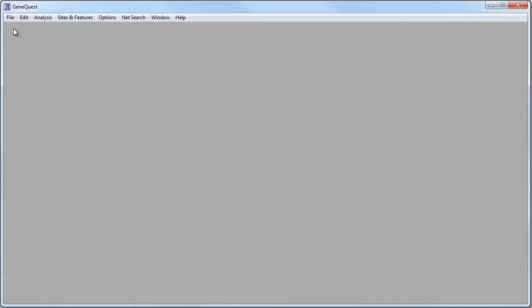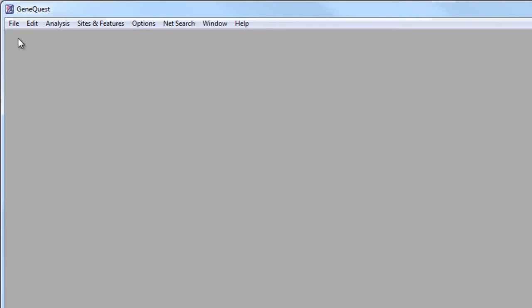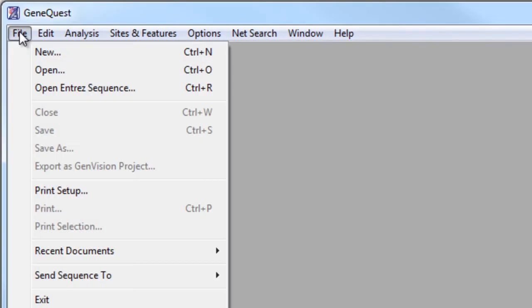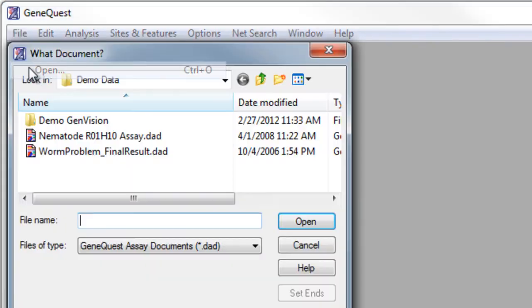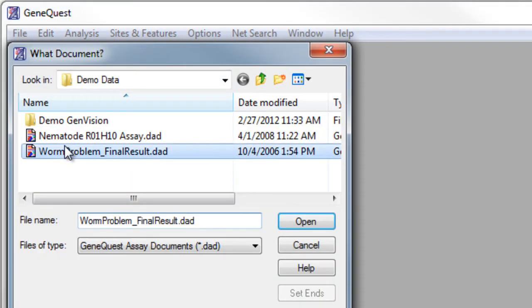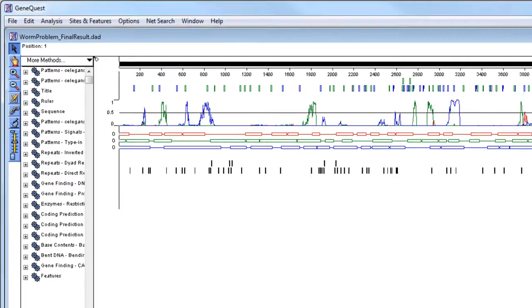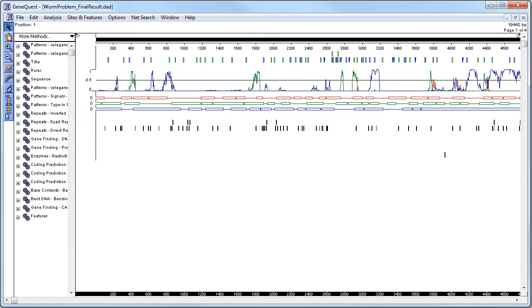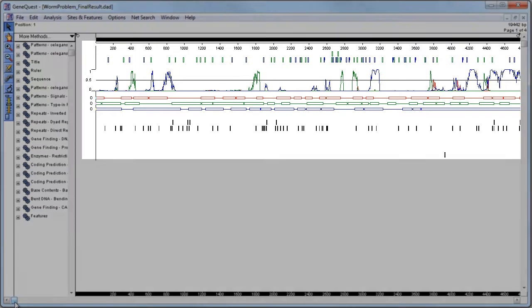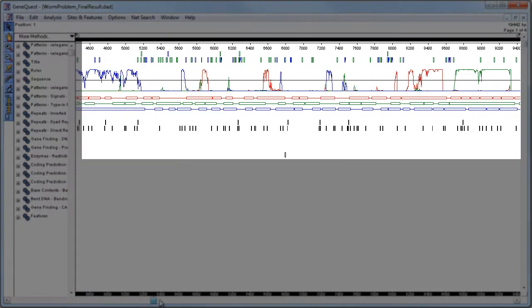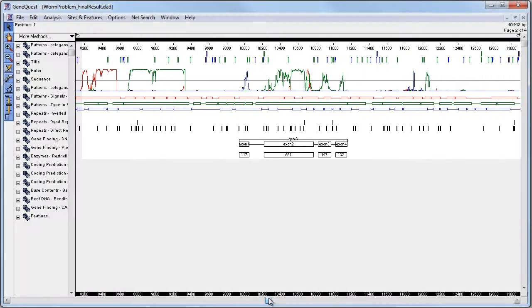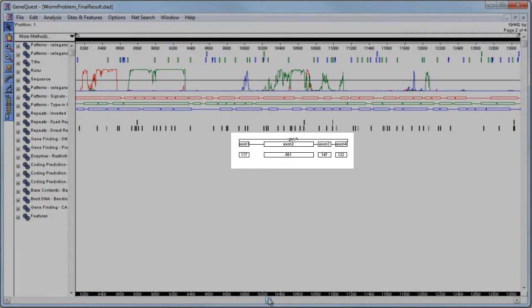To locate transcription factor binding sites in GeneQuest, first open a sequence file. In this case, I'm going to use Worm Problem Final Result from the LaserGene demo data. You'll see that this file already has some GeneQuest methods applied, and it's also been annotated with a gene.